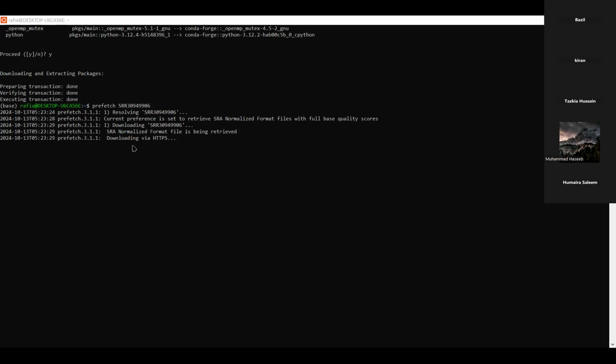Hello, sir. Assalamualaikum. Yes, sir, Rafia. I can see you are downloading the data. Yes, it is downloading. You can see, it's a simple thing: if you are not able to type anything, it means the command is running. Okay, sir, so it is downloading data. But just keep in mind, the data you are trying to download will be a big file, around GBs.